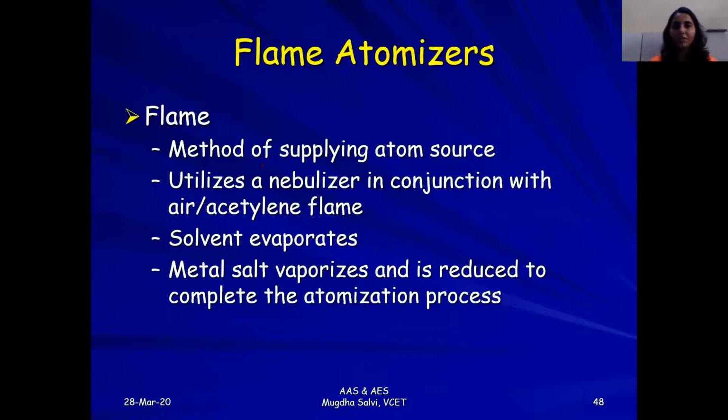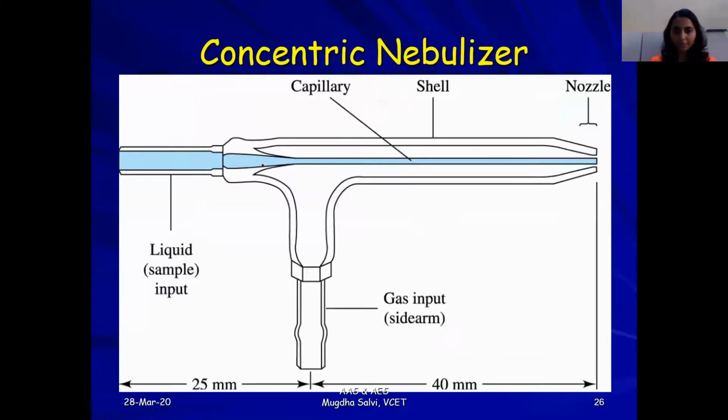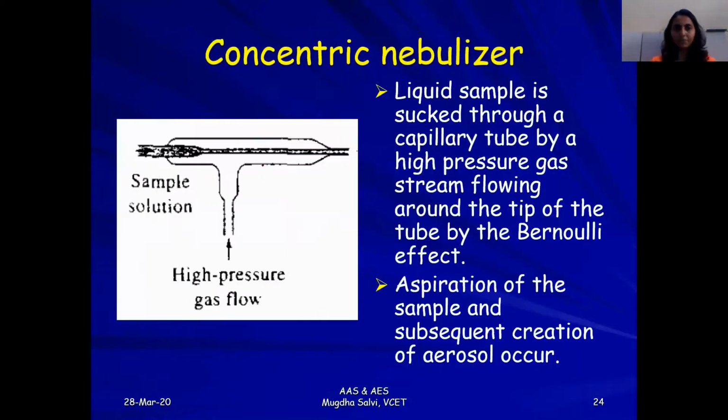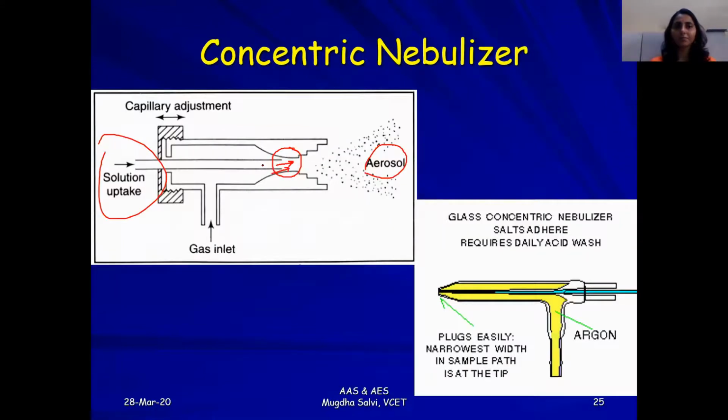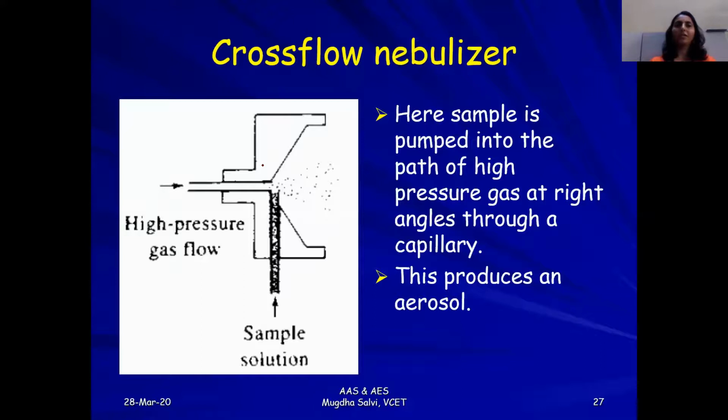If you want, I will just go through the diagrams. I will display the diagrams again. This is the concentric pneumatic nebulizer. Cross flow nebulizer.